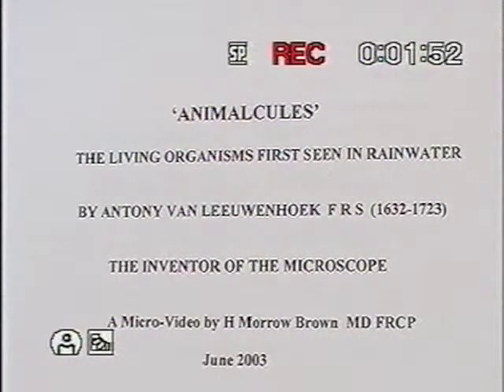Investigating the formation of crystals on spore trap slides, it was also noticed that many of the raindrops seemed to be infested with motile organisms. These seemed of some interest, and we had actually forgotten that these were the very first microorganisms to be seen by the inventor of the microscope, Anthony van Leeuwenhoek.